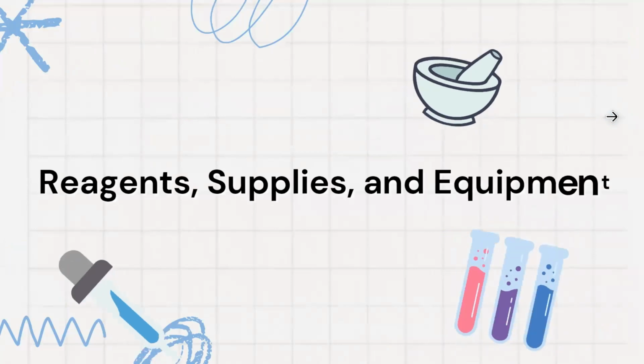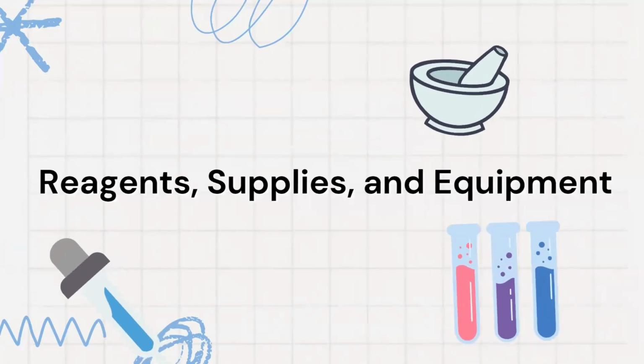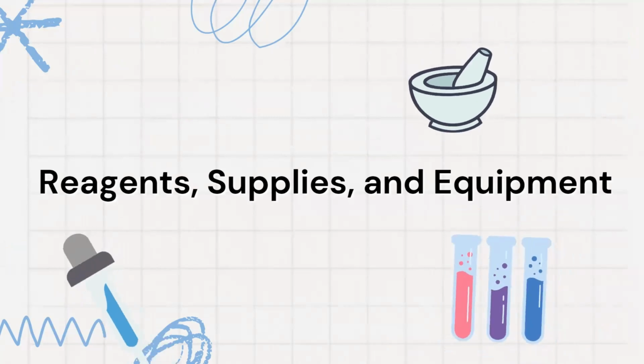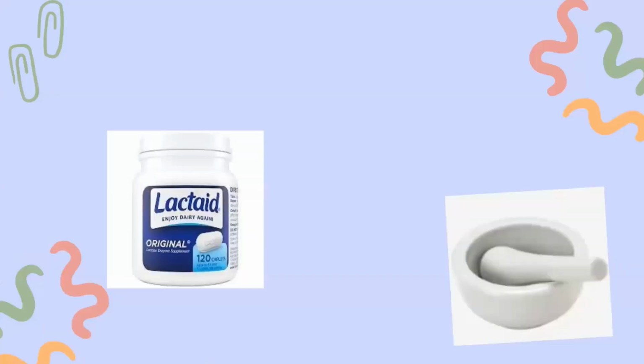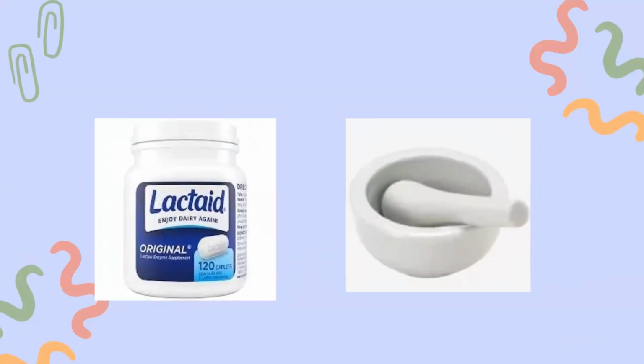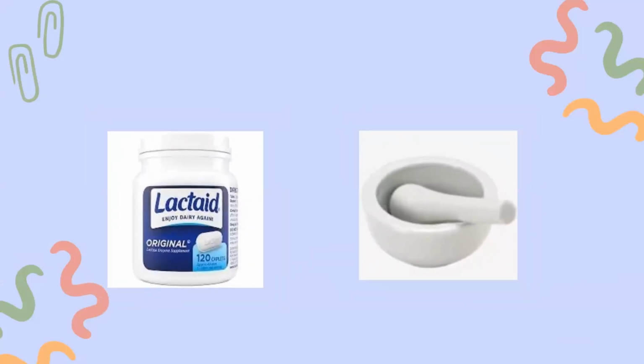Then we will introduce the reagent supplies and equipment used in this experiment. So first, we will use commercial lactase tablets, a mortar, and a pestle.